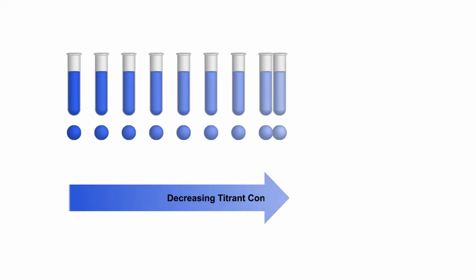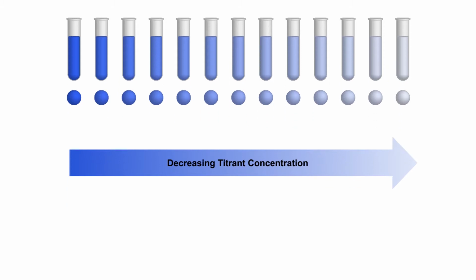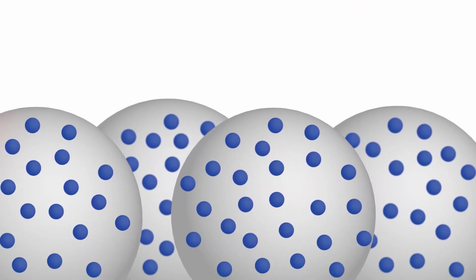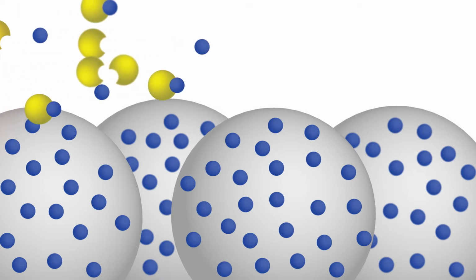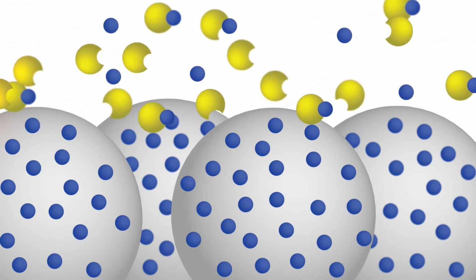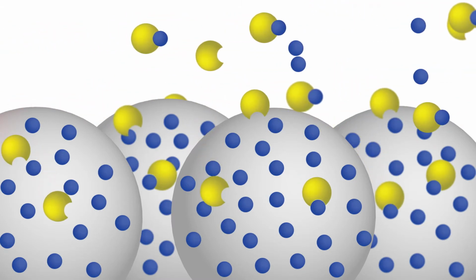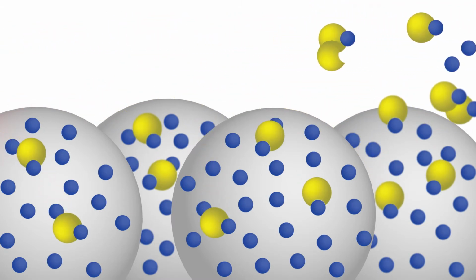In solution, one of the binding partners is kept constant while the other binding partner is titrated. The titrated partner is also used to coat beads that are loaded into the flow cell prior to each measurement. Each sample contains binding partners that are both free and in a complex. The short contact time with the bead column does not allow for significant dissociation of the complex, so that only the free constant binding partner is captured.